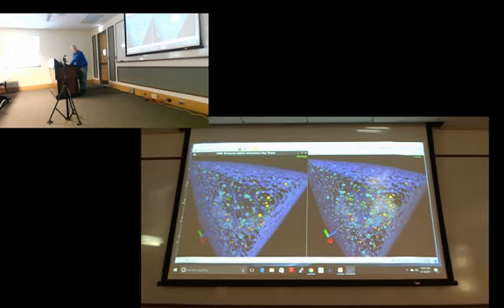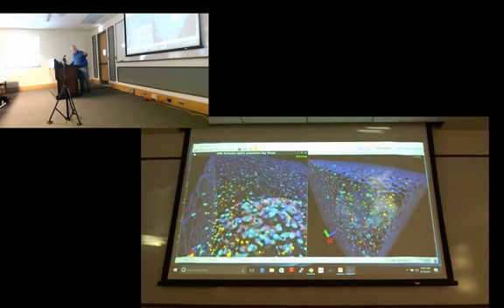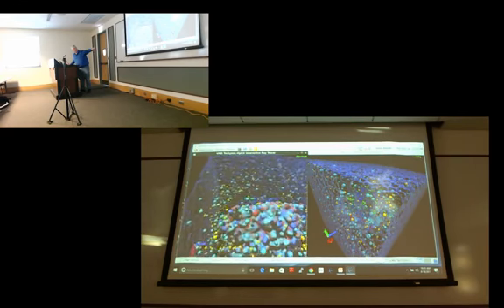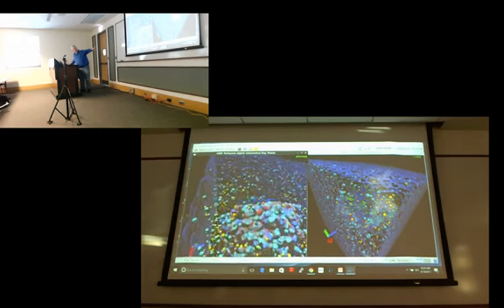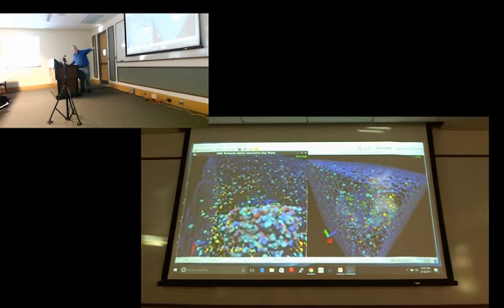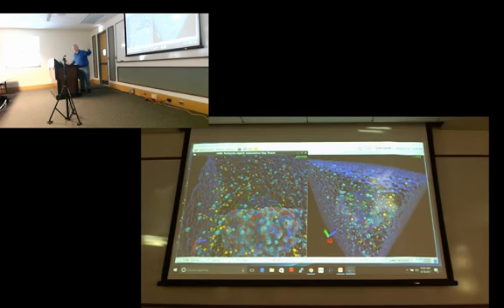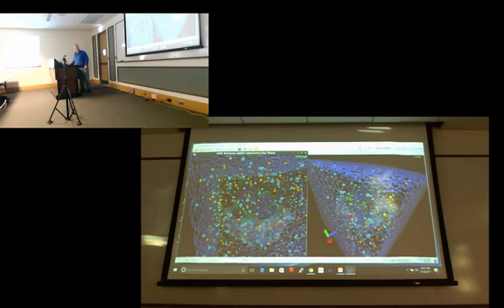All right, so now I've got the focal blur turned on. I should be able to toggle it on and off. There we go. So good. So now I can rotate this around, and you can see while I'm rotating, you see the little shadows of those ions on the surface. If I let go, then it has enough time to finish doing all the lighting calculations. Right now, those shadows are very dark and they look very harsh. If I let go of the mouse, they smooth out because it takes light samples from all the other directions, so you get to see that Monte Carlo sampling do its refinement.